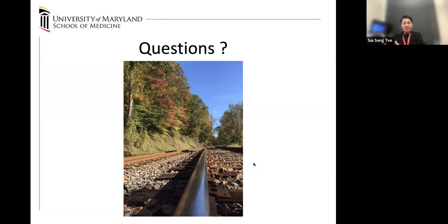That's why I was really excited to work with you to see if we can use optical techniques to answer more specific questions about metabolism at a more refined spatial resolution. Metabolism isn't mediated by a single cell type. When we are looking at tumors, there are tumor cells, immune cells, fibroblasts. Hyperpolarized MR is not able to answer those questions. We see a lot of lactate, and we don't know where that lactate is coming from.